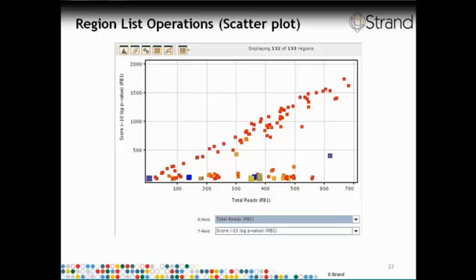So to summarize the information in the Genome Browser, we have a variant support view. By right-clicking on any point in the Genome Browser and choosing the variant support view, we get a 20 base pair window surrounding the chosen location. You can think of it as a vertical slice of the Genome Browser, and all the distinct read sequences have been clustered together. So we can see that there are 264 reads with the first pattern, there are 11 reads with the second pattern, and so on.